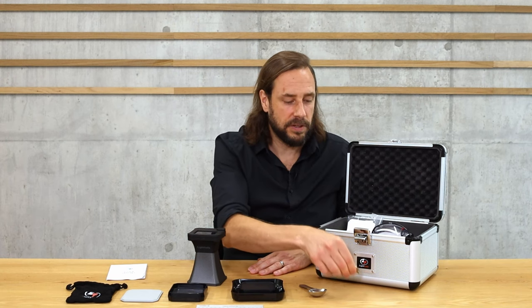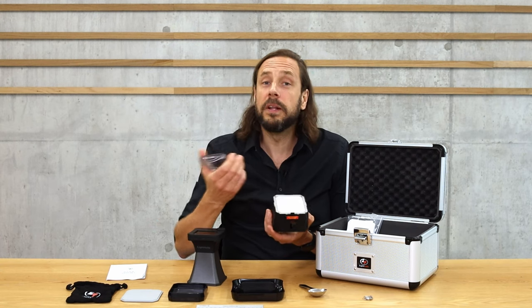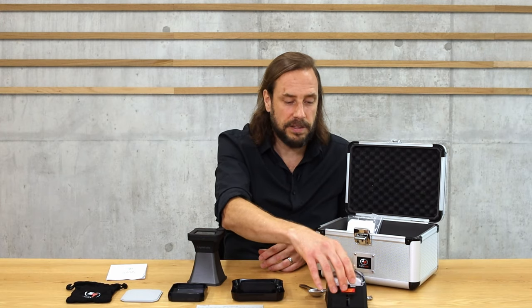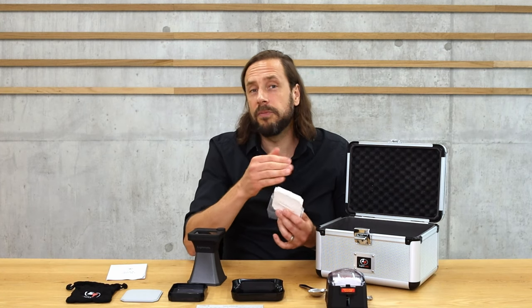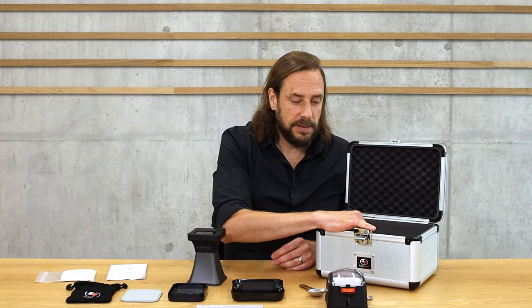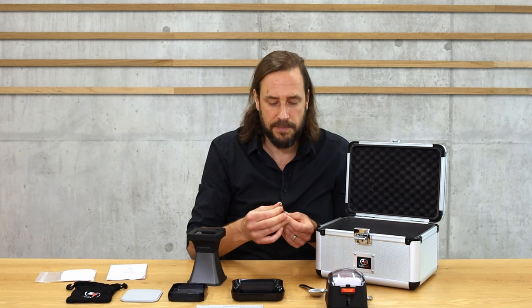There is also a small key to lock the case. For the particle distribution measurement, the most important component is this tray where you place your sample and measure particle sizes. You'll notice a small white plate inside — once it gets dirty, you can replace it. You get quite a few of these white plates, and when you need to replace one, there are some screws to loosen using the small screwdriver that comes with the device.